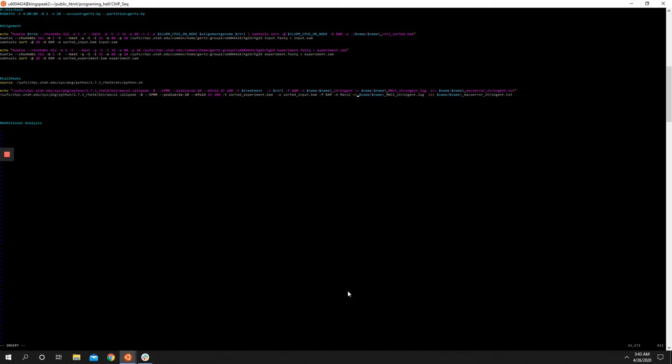Still not very informative. It's also going to spit out a bunch of stuff to standard out. It's not going to be putting the output to standard out. Thank God they put a little thought into this, but it will put out messages. If you're running this automated, it'd be good to catch those messages so that you can look back and feel confident that you got everything.